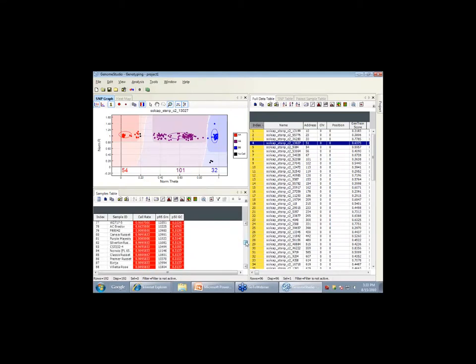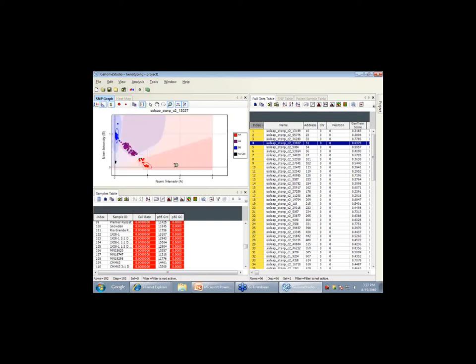Some of these samples, let's see. This control plate, what we've done with the control plate is we've actually spiked some controls in to try to define the cluster. We used a double monoploid, and we spiked other diploids in there in ratios of 4 to 0, 0 to 4, so 3 to 1, 2 to 2, 1 to 3. And so we should be able to see where those samples are if they're polymorphic, if it follows the dose. So I'm still on marker number 4. And let's look in the Cartesian view. It's easier to see.